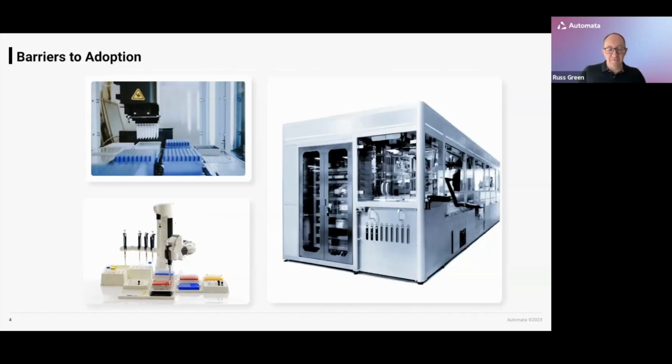We also see these fairly consistent barriers to automation that are very generalized, that are really based on emotion and experience, and the fear factor of driving this into laboratories. I'm in particular thinking about laboratories that really haven't had a huge amount of automation experience. So a lot of people consider automation to immediately be these huge monolithic systems, like the one on the right here, which is a very generic automated system. It doesn't really matter what it is.